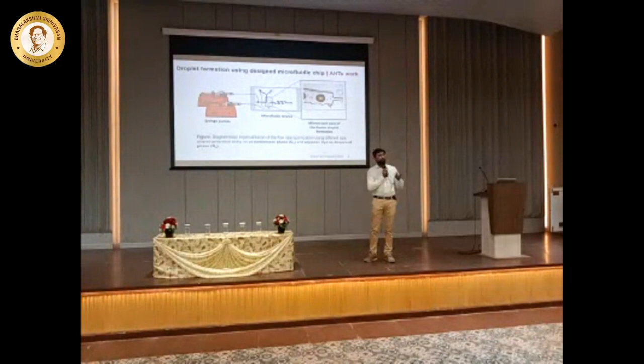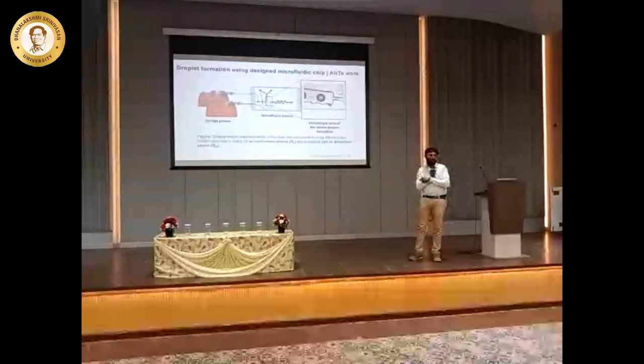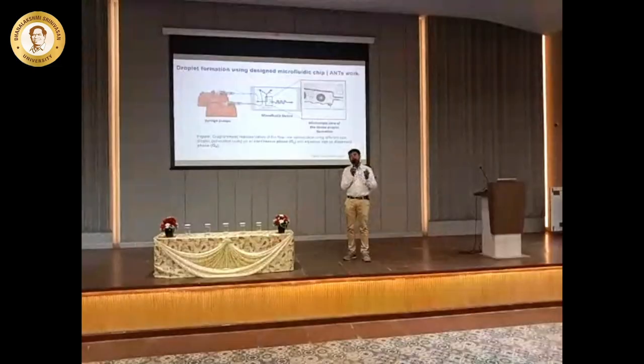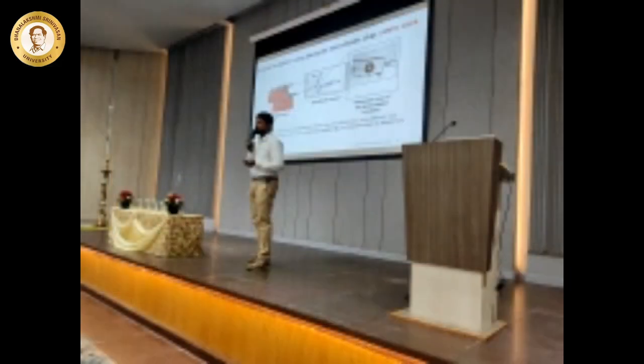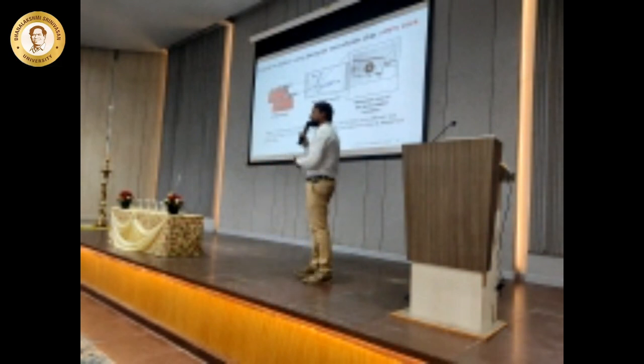It's possible. Another important challenge in a batch-based reactor is that you have a heating environment. But sir, then how is it going to work in a droplet? You're not giving any heat. You might ask this question. In a cooker, we add all these things, right? We heat it, we give a pressure, but we are not giving any heating here. The good advantage of this is that you don't need much heating, because very few species are getting interacted. The amount of species that is getting interacted is small. So you don't need external energy to make them into nanostructures. So that's another important thing, right? That's why all these microdroplets will give you beautiful structures when you make these droplets in your channel.